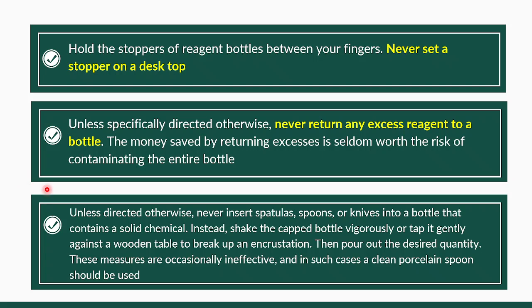Next, unless directed otherwise, never insert spatulas, spoons, or knives into a bottle that contains a solid chemical. So, dapat dili daw nato ipang-insert ang mga spatulas, mga spoons, mga knives diha sa mga bottle nga naay mga solid chemical.